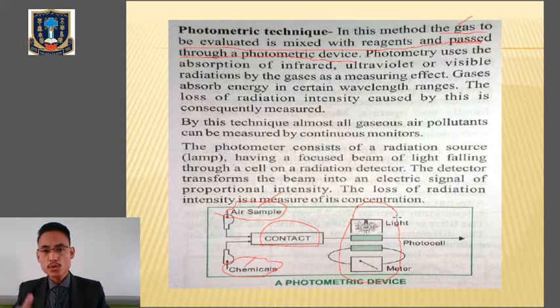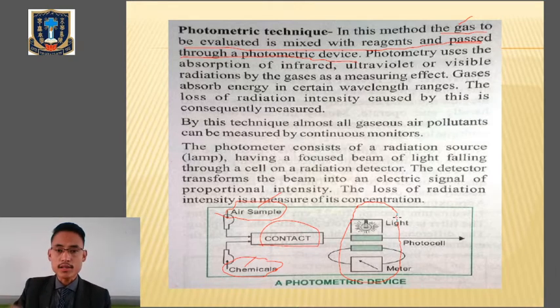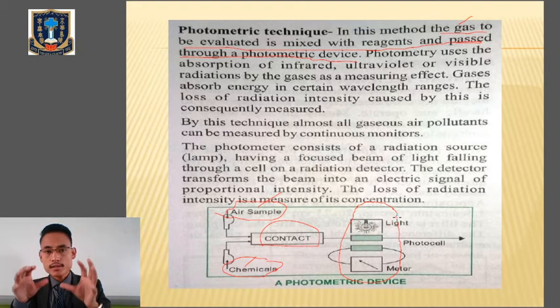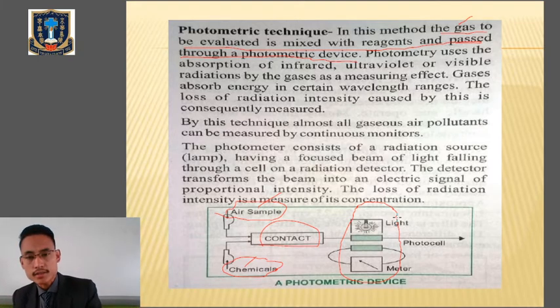And those gases will absorb this particular energy. Energy means those infrared, ultraviolet rays, or the radiations at a particular wavelength. Clear? So what we are doing over here, we are mixing the gases with the reagents, and after mixing, we are passing these gases through the photometric devices.